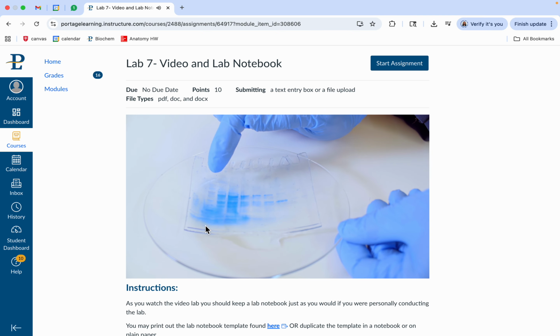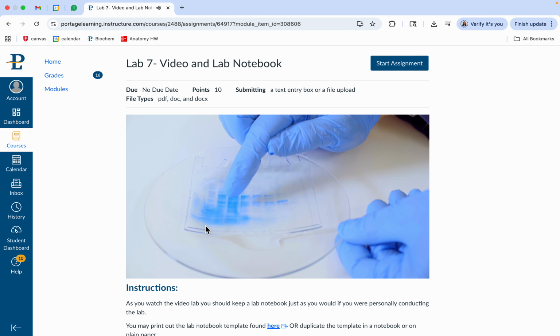Now let me show you what each column represents. So we know the first one's the molecular weight, 45,000. We should hone in on that. This next one, notice lots of bands, lots of intense ones, even at 45,000 Daltons. And this is our FR1. Notice here's FR2. And so notice we have a little bit of intensity of some things, and so higher protein concentration.